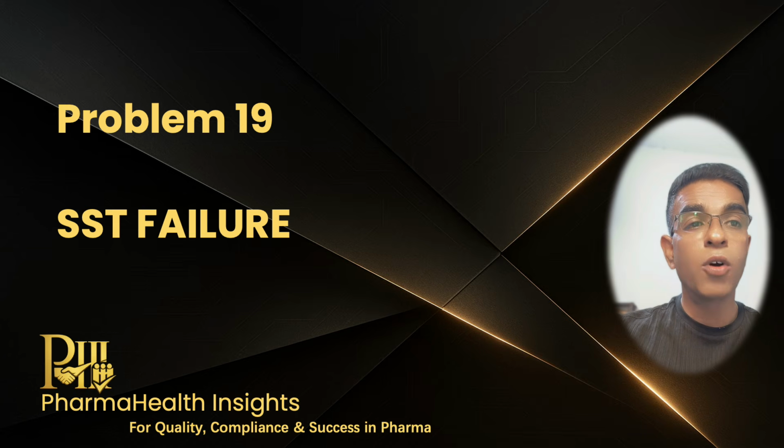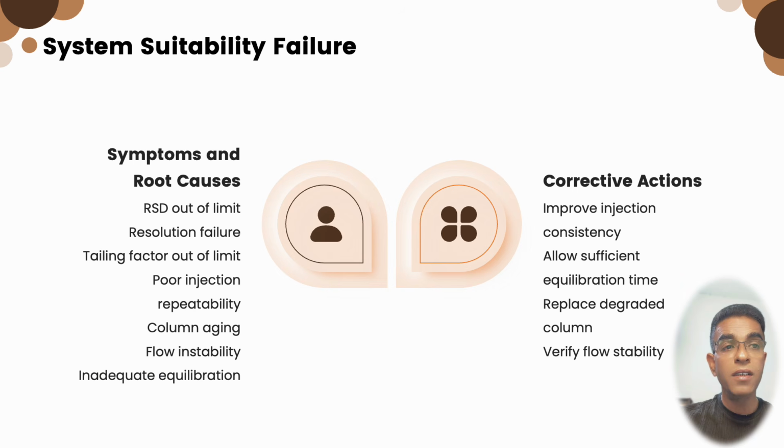Now let us discuss a problem where everything appears normal, yet system suitability still fails. SST failure is one of the most stressful situations during analysis. Even when the chromatogram appears acceptable, numerical parameters fail acceptance criteria. High RSD often indicates injection inconsistency or autosampler issues.